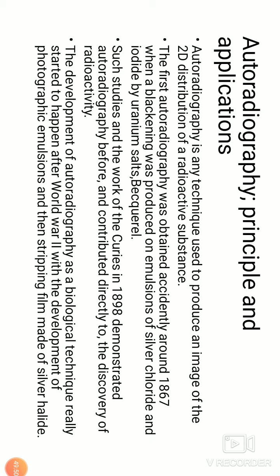The next topic I am going to take up is autoradiography. Here the concept of autoradiography started with the observation of Becquerel. I'll not touch the unit of radioactivity and all, but what he observed is that when silver chloride or silver iodide emulsion is touched with uranium salts, there is a blackening which can be seen. This observation led to the development of autoradiography. Autoradiography is any technique used to produce an image of the 2D distribution of a radioactive substance.